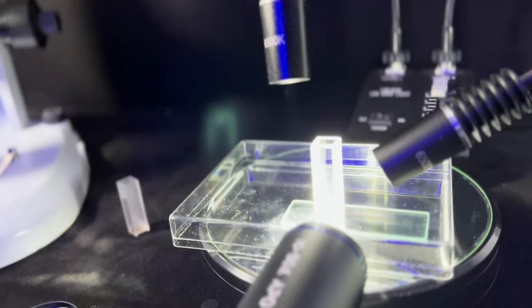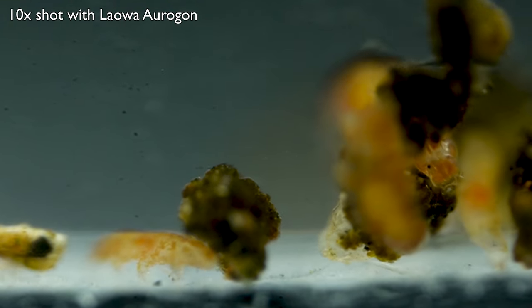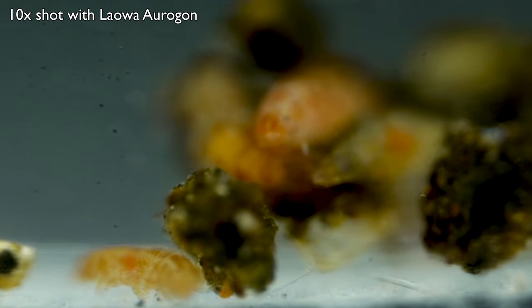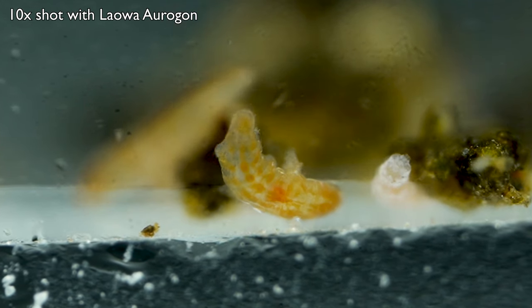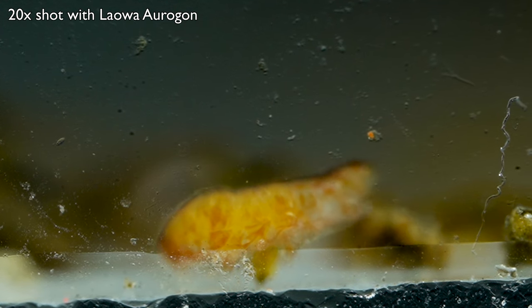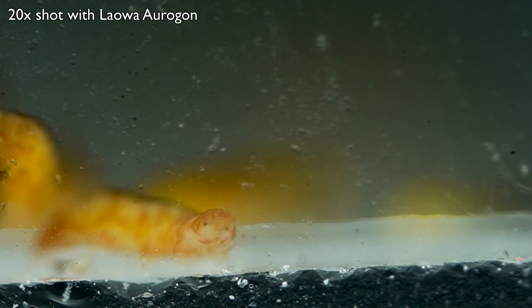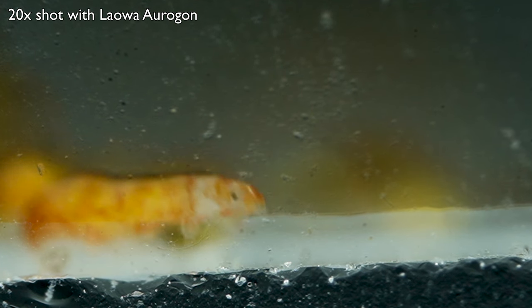I thought I'd test it out straight away with water bears, because I love water bears — and so do you! These are incredible. Starting off with the 10x magnification, you can see we're getting a really interesting view of the water bears in their natural habitat. This is now the 20x objective. The picture is sharp, we can see the fine details of the water bears like their eyes, and the colour resolves well also.